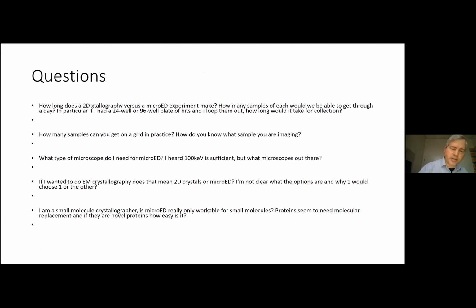So then I just copied a bunch of questions I got in the email, and I'll go through them one by one. So how long does a MicroED experiment take?